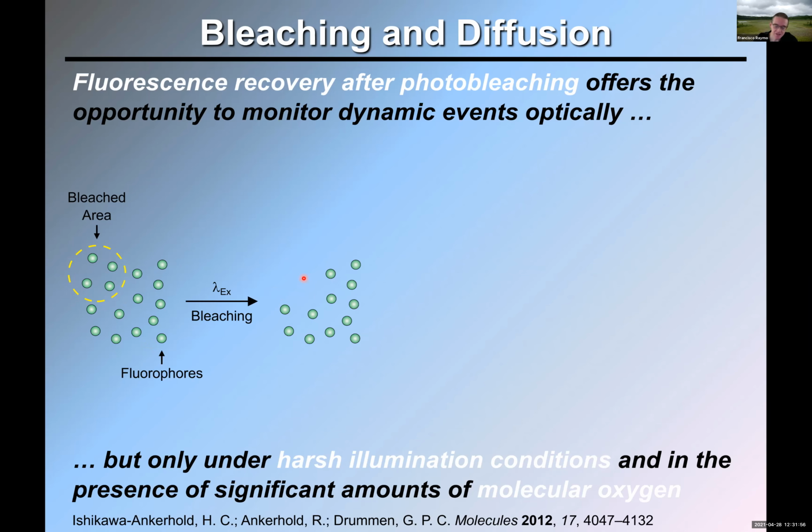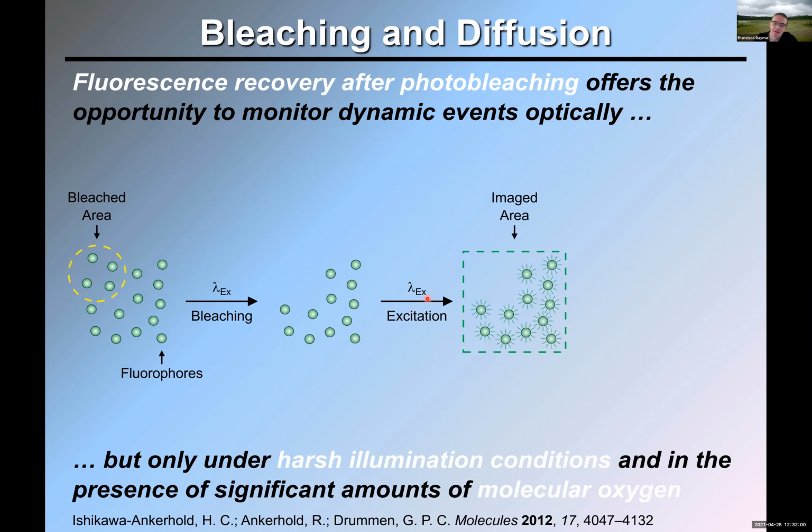And then after this bleaching step, you can acquire a conventional image. Fluorescence will show up everywhere apart from the area that was originally bleached. So we're turning fluorescence off in this spot only, okay? But if these molecules can diffuse in the sample, if you wait a certain amount of time and then acquire an image, by that time, let's say this molecule might have moved back into here, and this might have moved back into here.